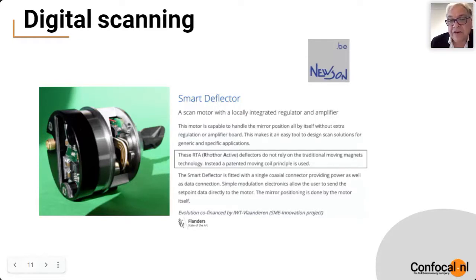So these scanners now can be programmed, and they execute the program. In our configuration, they work very nicely because you can say to the rescanner, please follow the scanner. So no extra programming is needed. They are always in sync. With this, we have better precision. Next slide.